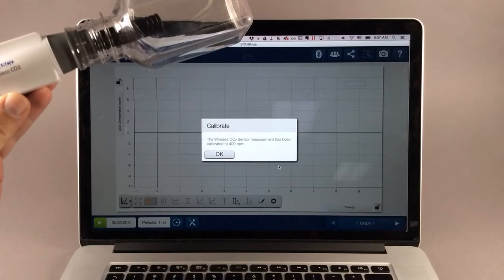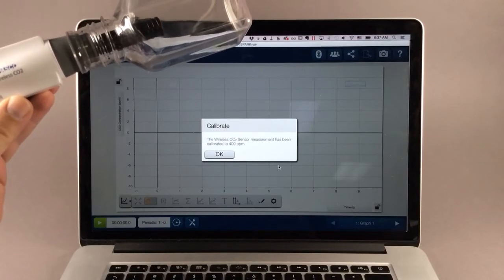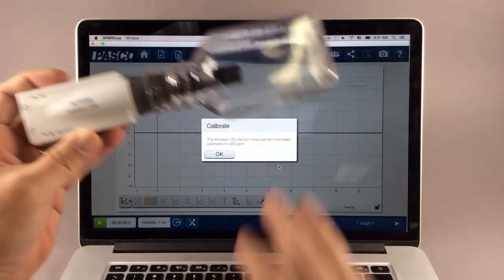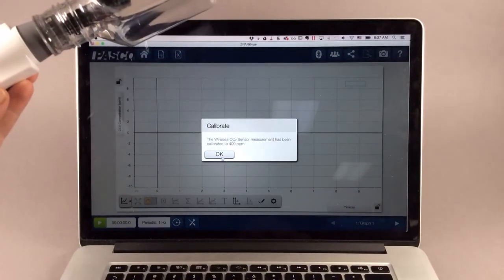SparkView reports that the sensor has now been calibrated to read 400 parts per million for this fresh air, and you can continue with the experiment. This calibration is saved in the sensor itself.